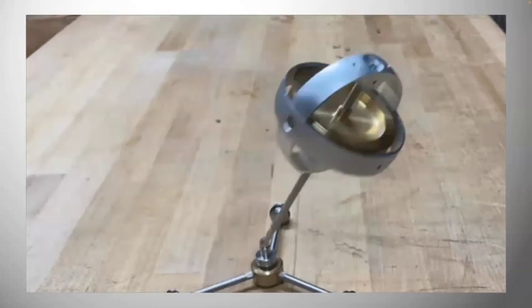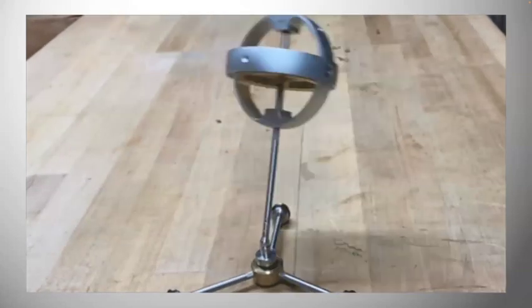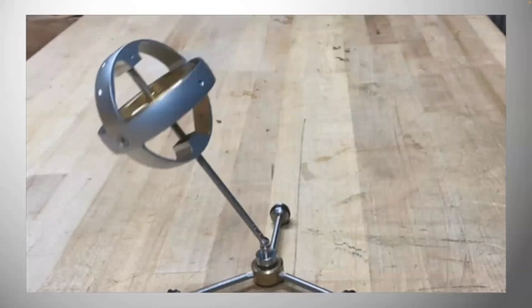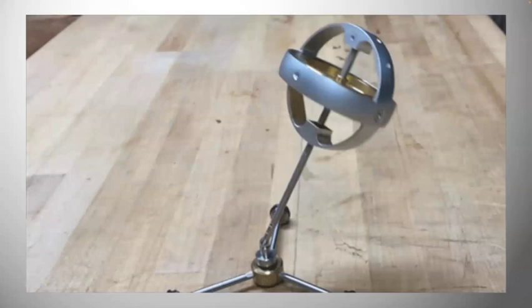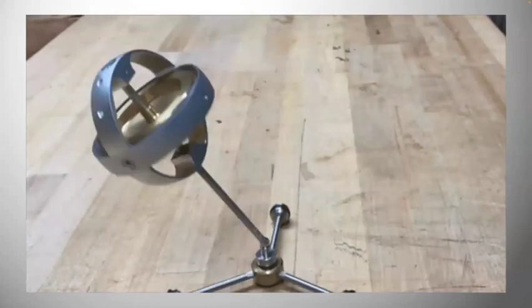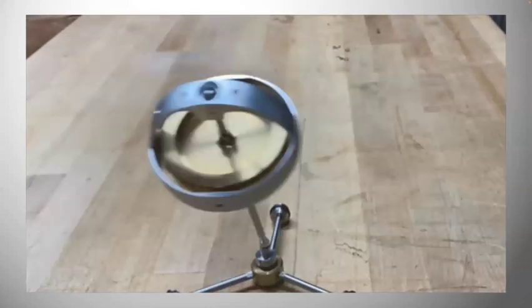The same equations of motion that describe this gyroscope, which is spinning along the axis that is going around. So it's spinning along the center axis, and then that creates a force pushing it up. Gravity has a force pulling it down, and the net result is this thing called precessional motion, in which the gyroscope goes around and around and around. The precessional motion of a nucleus is proportional to the magnetic field strength. So at 600 megahertz, at a 14.1 Tesla magnet rather, a proton will resonate at 600 megahertz.